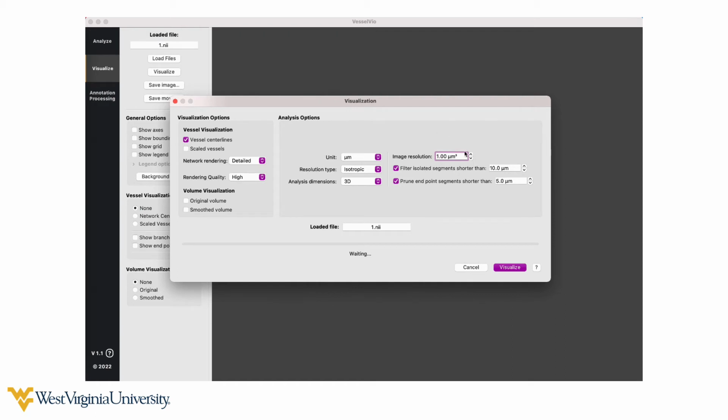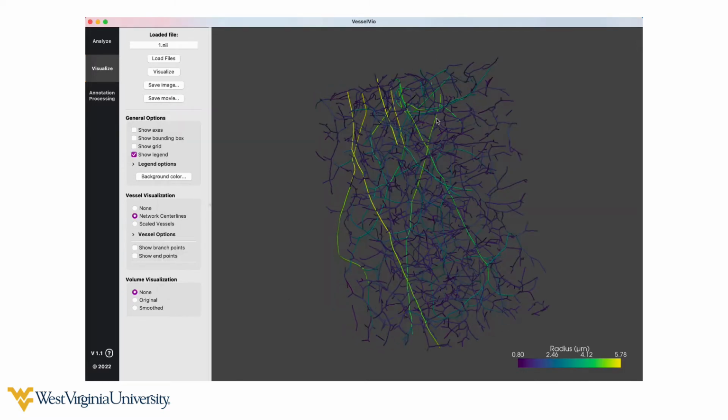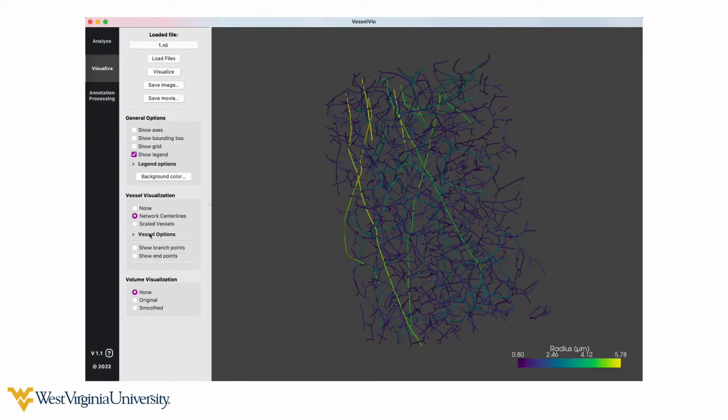First, because I think it's highly important to be able to visually inspect and confirm the results that the app produces, you should always load example datasets for visualization. During the visualization stage, you can select the analysis parameters just as you would on the analysis page, and then the dataset will be analyzed. The results from this analysis will be used to generate meshes for visualization and inspection.